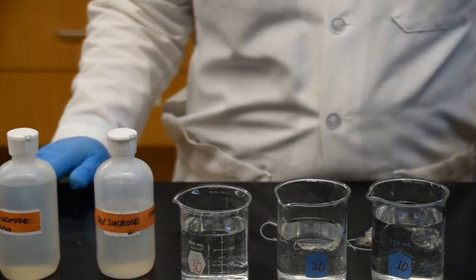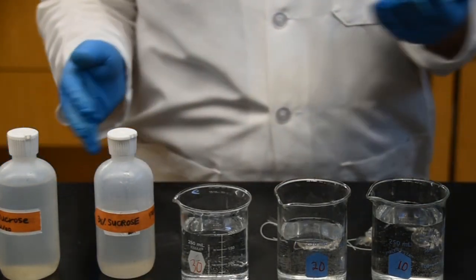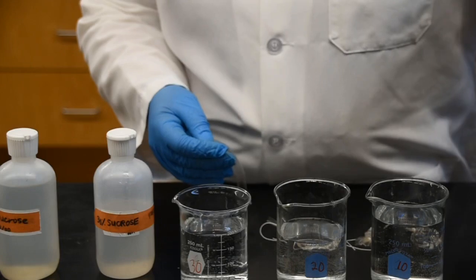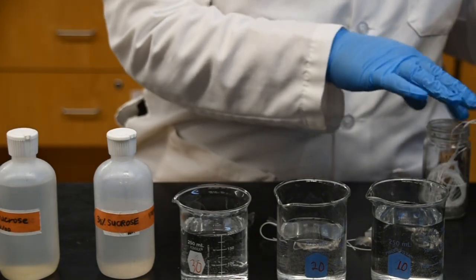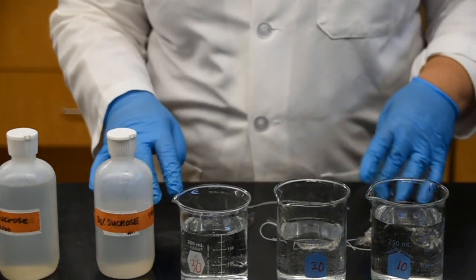Now again, I'm just going to take a second and show you how to properly set up these tubes. So here is a piece of dialysis baggie. I'll take a couple pieces of string. And all you do is kind of like wrapping a piece of candy.